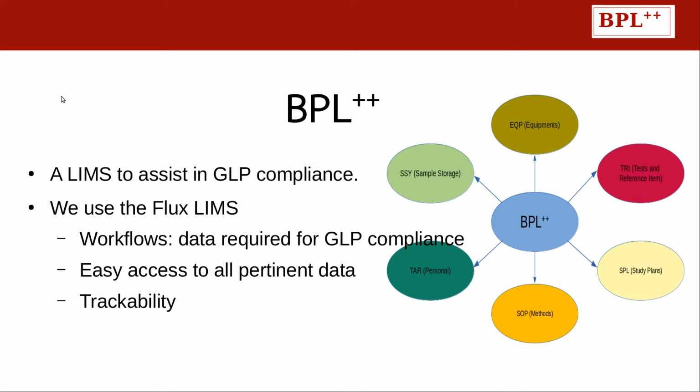In this work, we present BPL++, a LIMS to assist in GLP compliance that has been developed using the Flux LIMS. Workflows that specify the data required by GLP have been developed, providing easy access to all pertinent data as well as trackability.